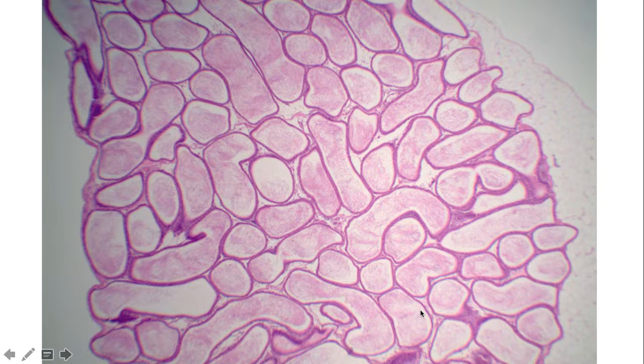As we move on to the second slide, we're into the epididymis. And the thing to notice here is it's also just a big collection of tubes, and more specifically, it's one really long tube. So the duct of the epididymis, or the ductus epididymis, is a single tube that's going to be present in each testis, actually just outside the testis. And it's in here that the spermatozoa are going to mature. So they may spend a few weeks within the epididymis, and more specifically the duct of the epididymis, and this is where they're going to mature.